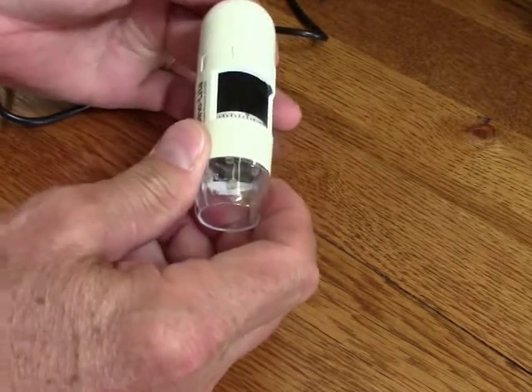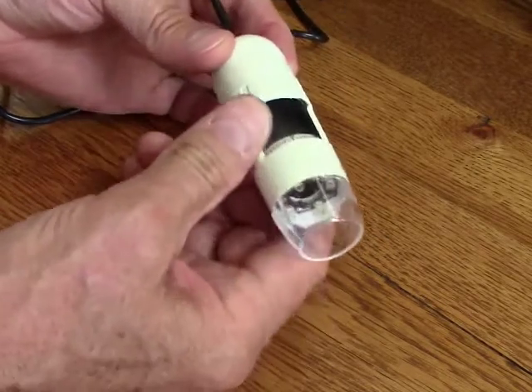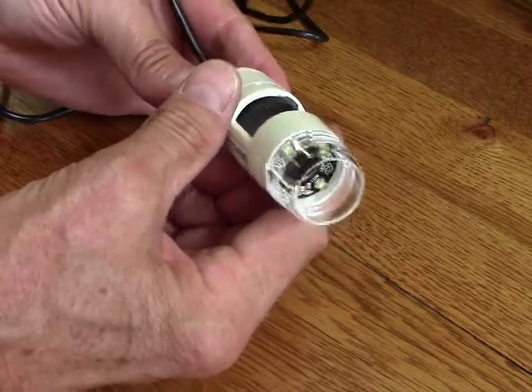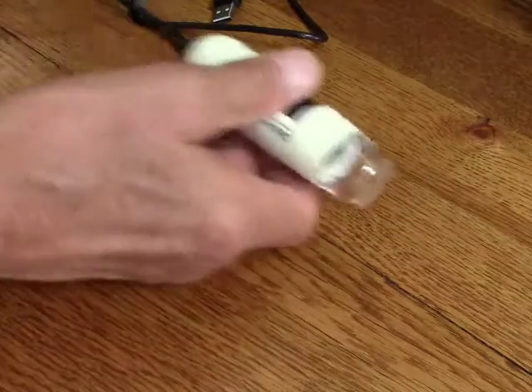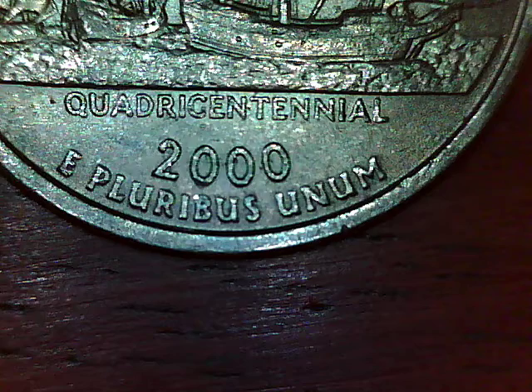It really works well. It's a lot of fun and you can just look at all sorts of things with this — you can even look at your skin, the hairs on your hand for instance. You can look at little flowers, bugs, whatever you want to look at, you really can use this on. And the fact that the LED lights illuminate everything makes it fun to use.